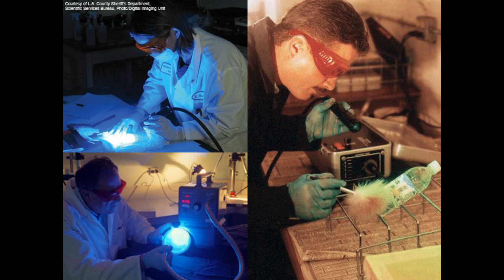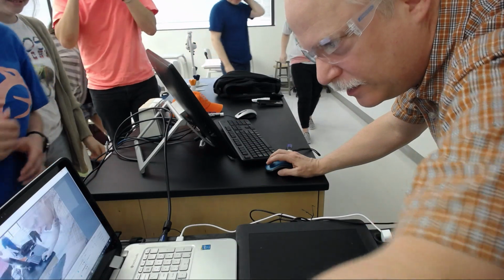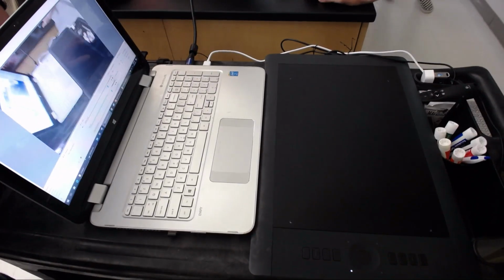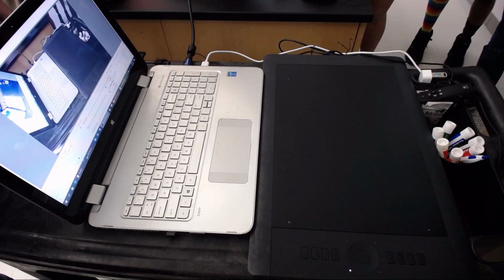If someone wants to take turns, you can come up here and look. We can see how dirty my keyboard is. Okay. The plastic is enough to block the UV. If you have glasses, that'll block the UV. All we need is some sort of plastic or glass between us and the UV. Let me switch. I'm going to go to 5 here. Okay, I'll shut this down. If you're not up here, you can see up there maybe.